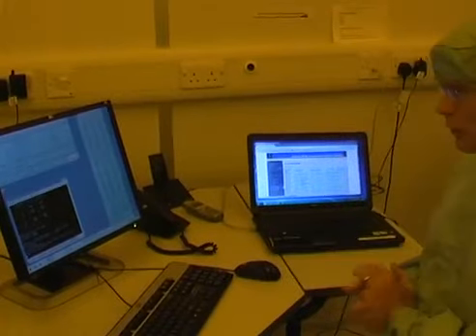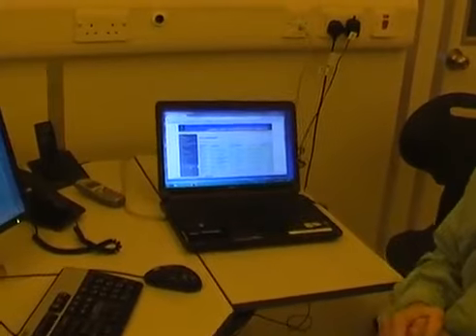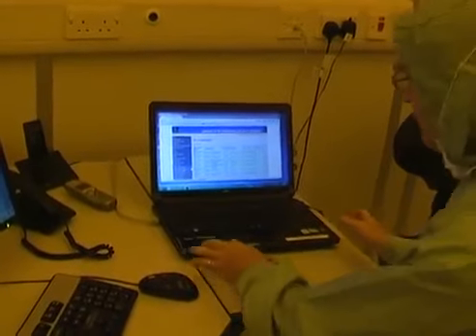While I'm waiting for the load process to complete, I'm going to log on here and have the website ready for action.